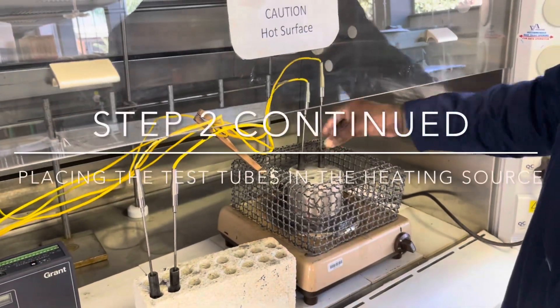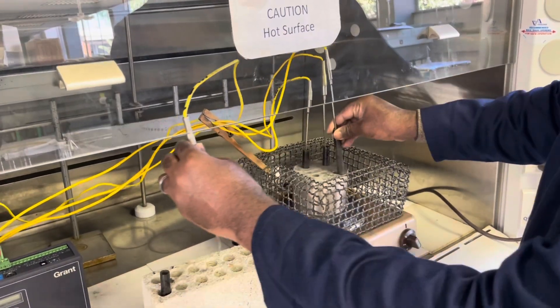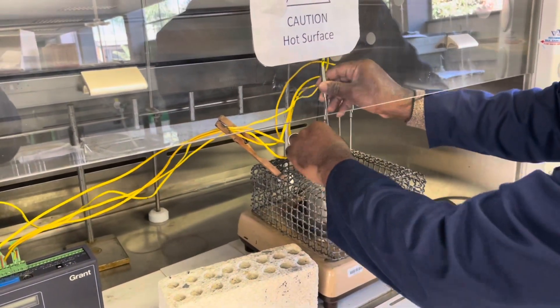Place the test tubes in the heating mantle while ensuring that the plastic wires of the thermocouples do not come in contact with the wire mesh or the heating source itself, since this will damage them.